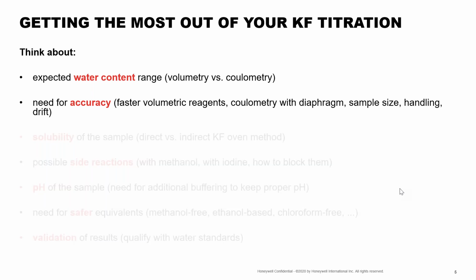We're going to start right at the very beginning. So how do we choose the right type of Karl Fischer titration for our sample to give the most accurate results? And then we'll dive into some considerations that you may need to take depending on your sample itself. To begin with, we're going to review the two main types of Karl Fischer titration, as well as what types of samples each of those is suited for.